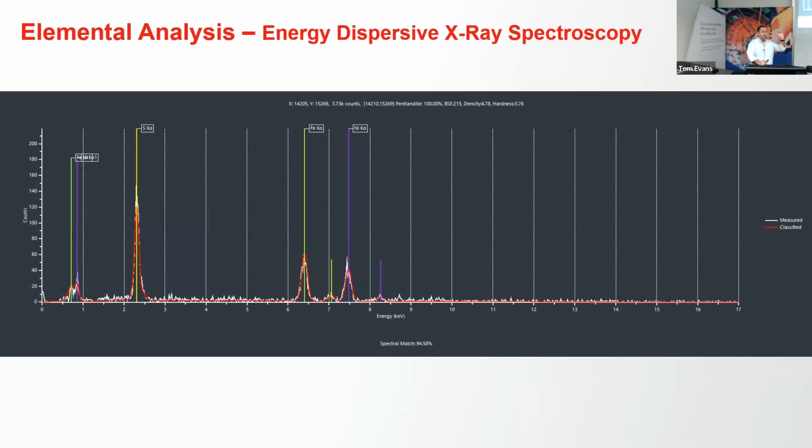After the spectrum gets compared against the database, the software will find the best match. But if you have 4,500 minerals, finding the best match could be very time consuming. The software also has to deconvolute mixed spectrum cases, which is super time consuming and can still leave the door open to false positives. With a very big library of 4,500 minerals, it doesn't guarantee the results will be more accurate. So we recommend a short list of maybe 40, 50, 60, or 100 minerals that you're interested in for a particular deposit, rock type, or application, and constraining the list to those. That's also how you train the software to know which minerals make sense for this type of rock.